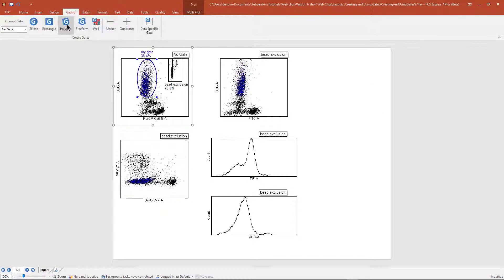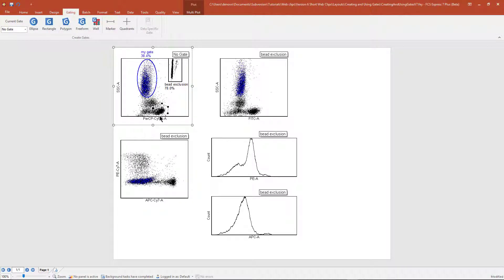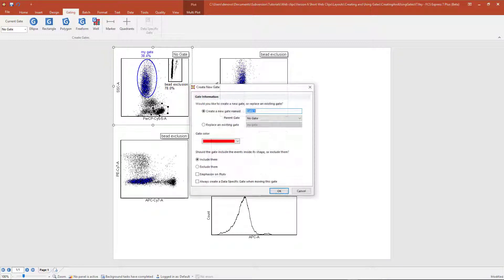The polygon gate can be created by clicking once on each vertex and pressing the space bar or clicking on the original vertex to close the gate.